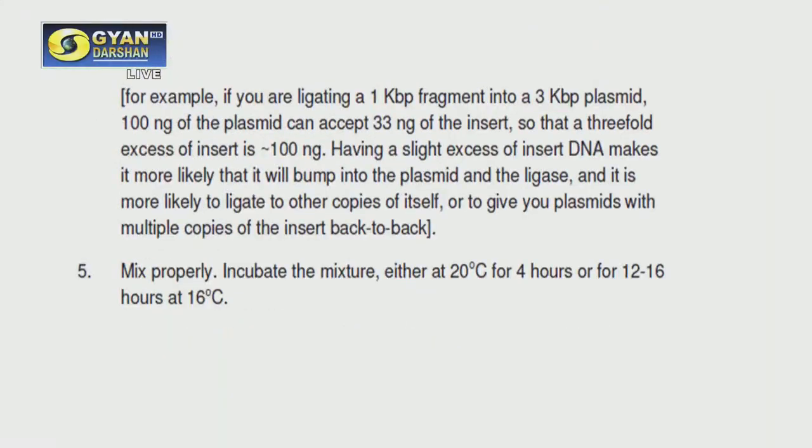So that is about the vector molecule. What would be the insert molecule? Now here there is one rule. That is, the insert molecule should be 3:1 molar excess over the vector molecule. So you have to calculate the molar excess. Now what is meant by this molar excess? You have to understand that very clearly. Like I gave you an example here.